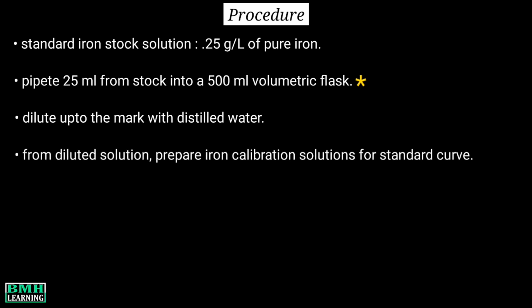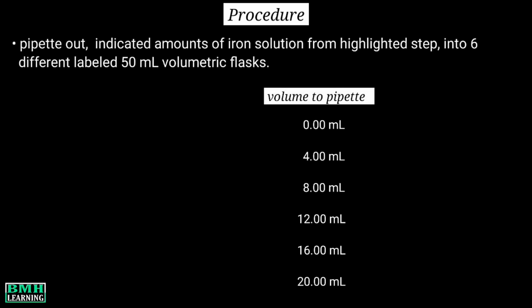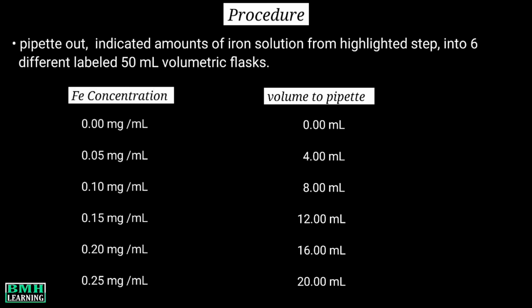Now from this diluted solution, we are going to prepare iron calibration solutions for the standard curve. So we are going to pipette out the indicated amounts of the iron solution from the highlighted step into 6 different labeled 50 ml volumetric flasks. The first flask is of course the blank because it doesn't contain iron. And these are the concentrations of iron in the different volumes used.